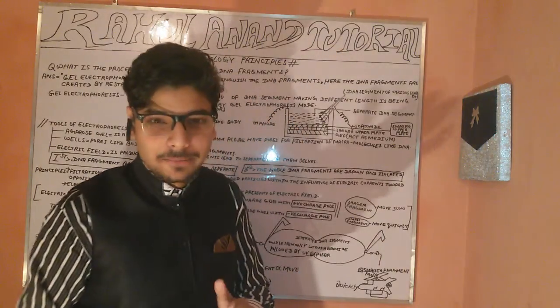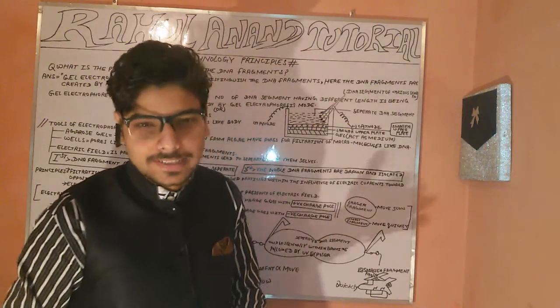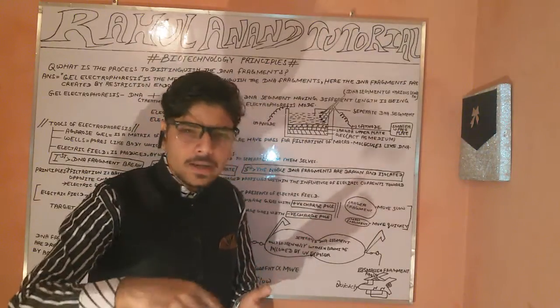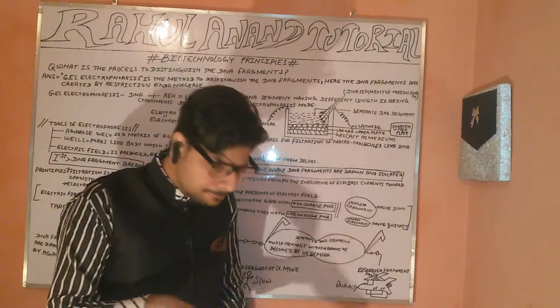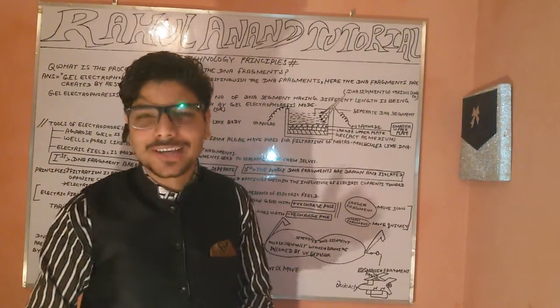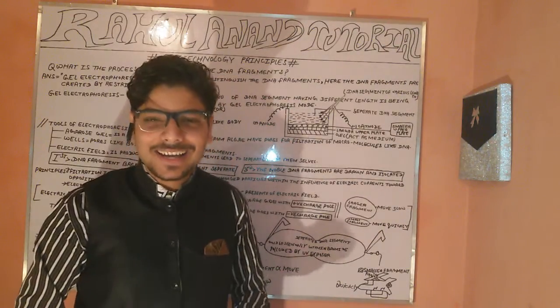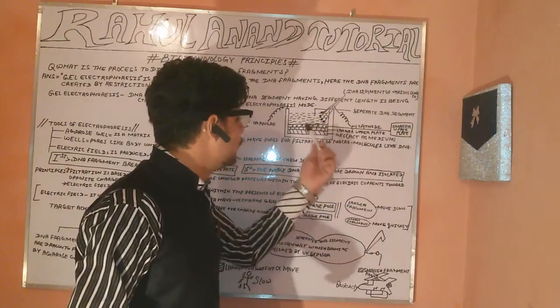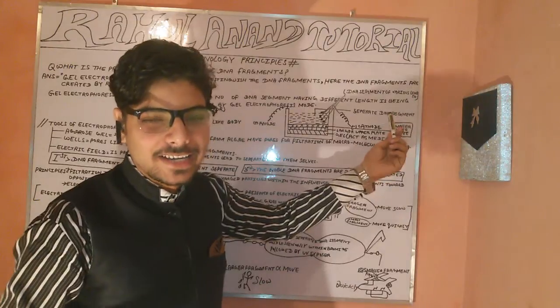Now, third we have the electric field. What does the electric field mean in the case of electrophoresis? The electric field plays an important role to accommodate and mix with the external charges which are produced at the cathode and at the anode. The cathode bears the negative charge, as well as the anode bears the positive charge. These are quite reciprocal cases. You can find here on the board: the anode bearing the positive charge as well as the cathode bearing the negative charge.